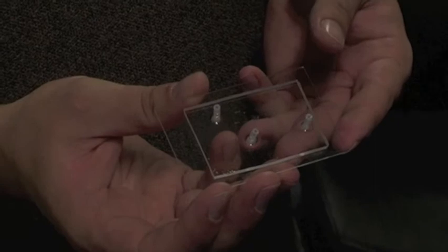Often it's useful to shrink this down into a tiny lab on a chip. We can use smart chemistry to grow tubes as narrow as a human hair. With these we can do microscopic plumbing.